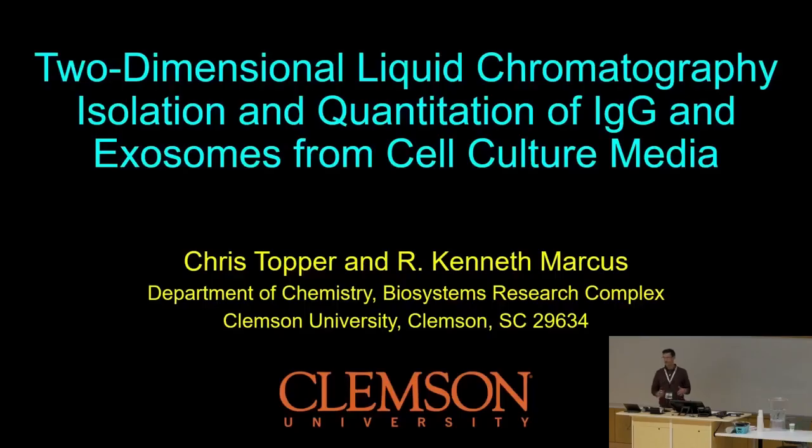So my name is Chris Topper. I'm from Clemson University, a second year PhD student working in Dr. Marcus's group. And I'm just going to talk a little bit today about 2D LC for isolating and quantifying IgG and exosomes from cell culture media.